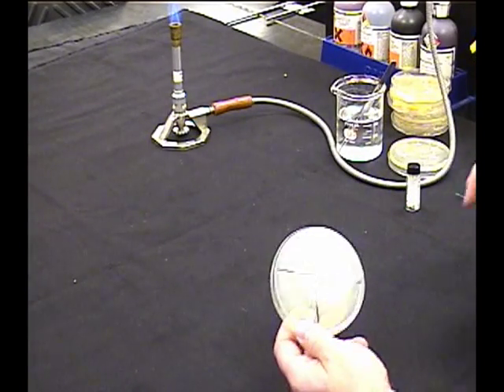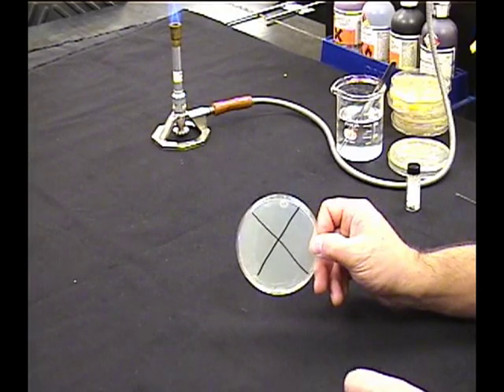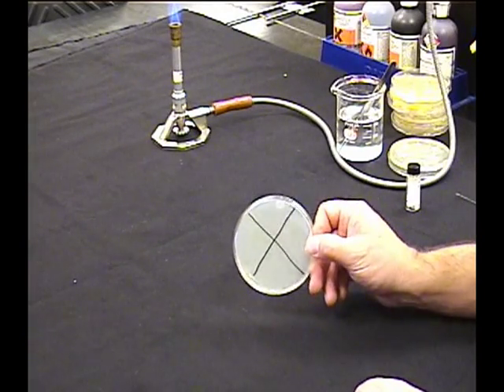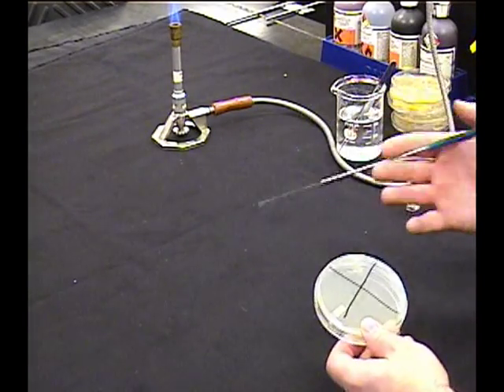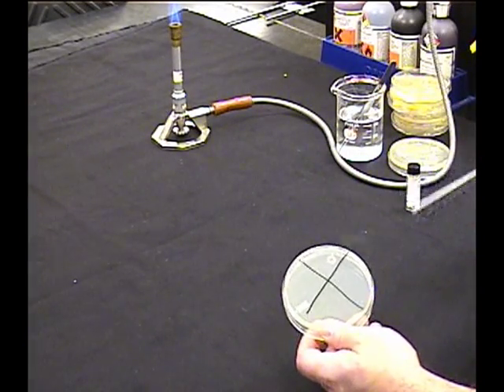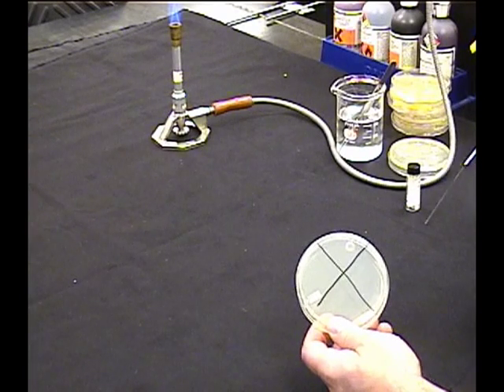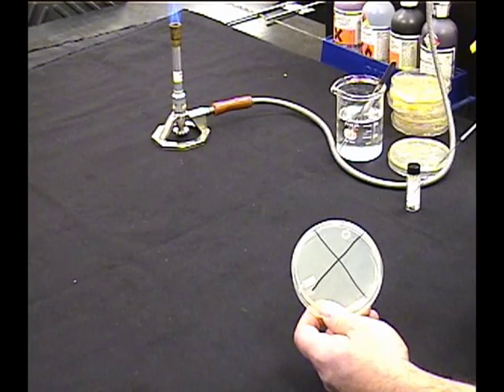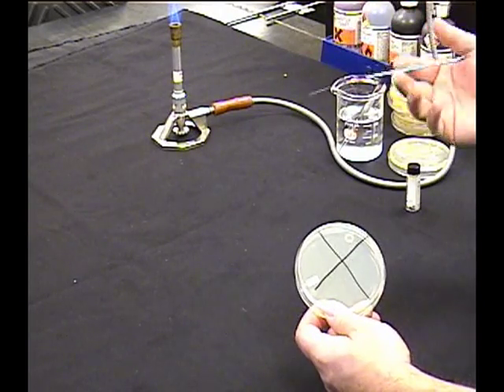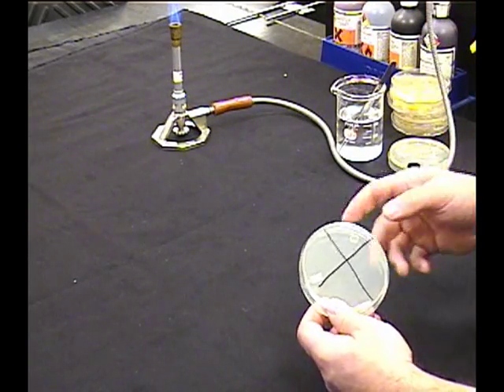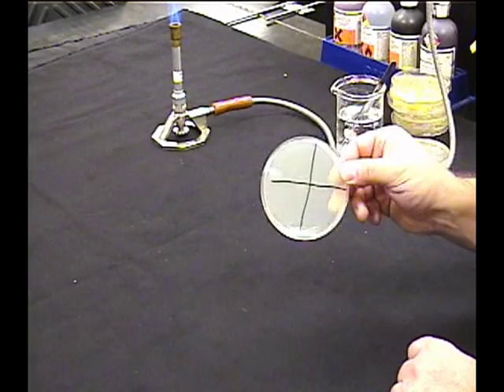Now we need to put organism on there. So what you're going to do is, again, using your loop, flame it, cool it, spread organism all over the surface, just like you did for the antibiotics. Once that's done, of course, you flame your loop, cool your loop, dump it.